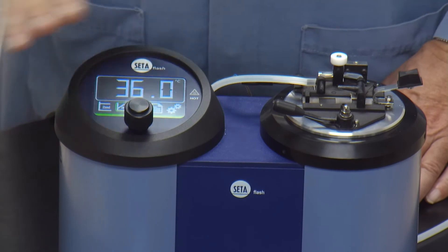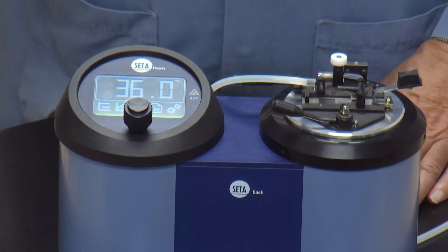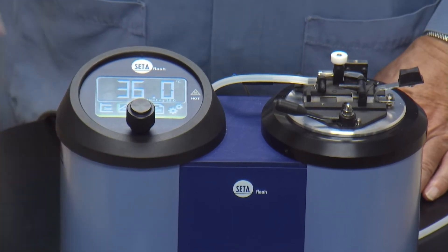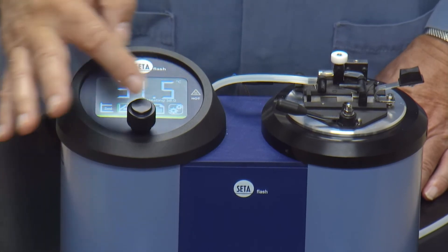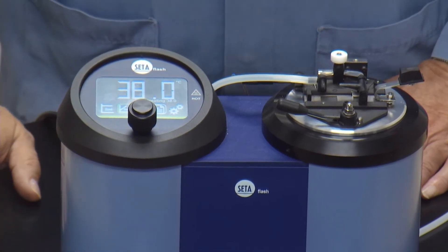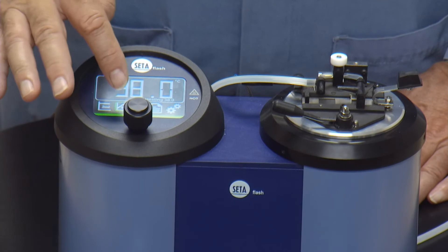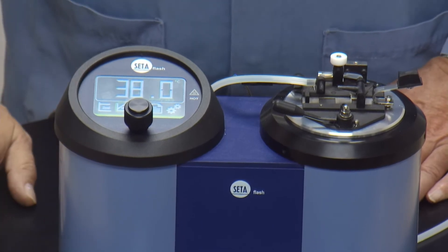To change the temperature, start a test, look at results, or go into the settings menu, you can either use your finger to touch things like the temperature and then rotate the knob to change it — for example, to 38 degrees — and press to accept, and it will start to heat up. Or you can use the control knob and the icons below will be highlighted. Between the touch screen and the control knob, basically anybody can be running this within 5 to 15 minutes of putting it on the surface. The information bar at the bottom also tells you when it's ready to test.